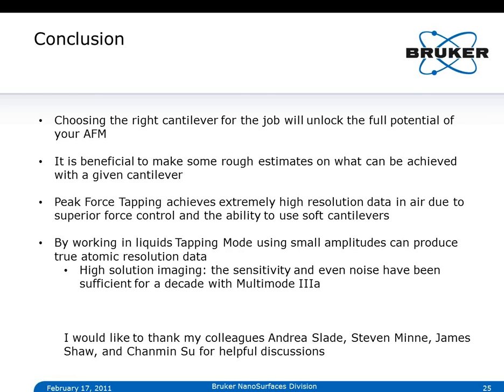If something sticks to the tip, I would usually say that's game over. You basically do not get rid of it at all. One of my pet peeves is when you calibrate an AFM, we typically use a calibration grid, and I absolutely cannot stand dirty calibration grids, and there are so many of them around.